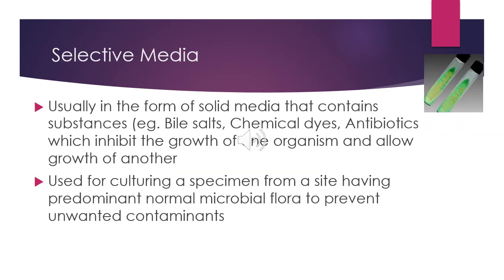When we say selective media, as the name implies, they are usually in the form of solid media, and they contain inhibitory substances such as your bile salts, chemical dyes, and antibiotics. They inhibit the growth of one organism and favor the growth of another.